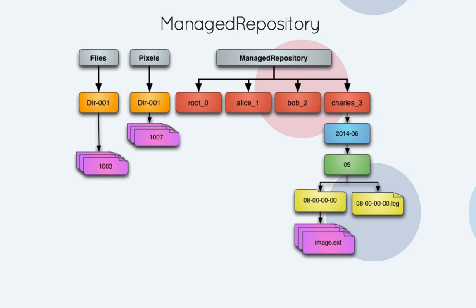In addition, there are pixels directories which may contain historic data from before the OMERO 5 system, but will also contain things such as pyramid files that have been generated. And finally, a files area which will contain various associated files that may have been uploaded with images.